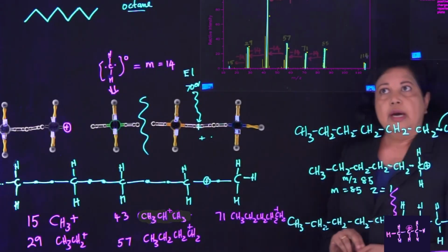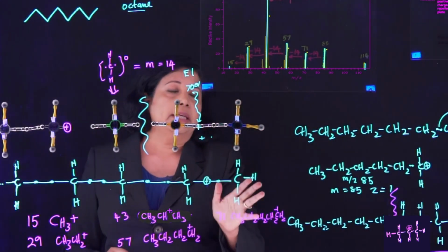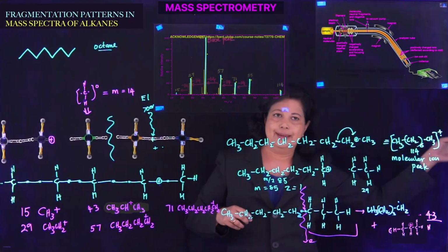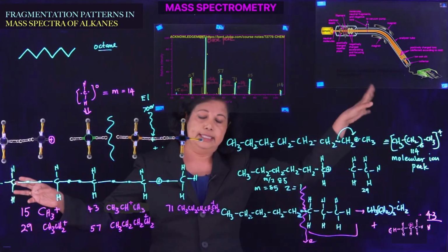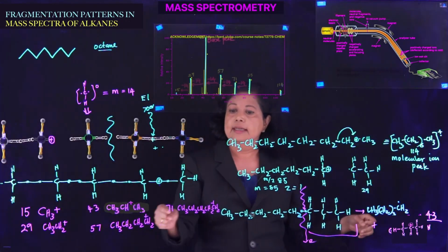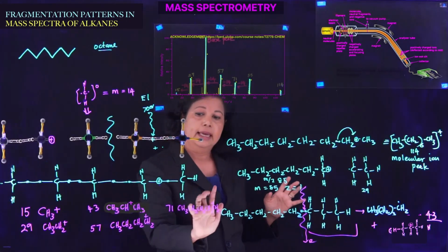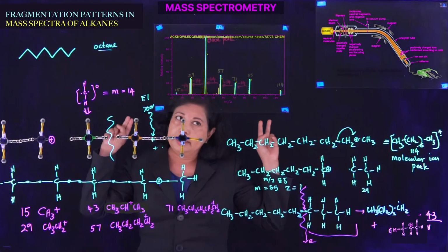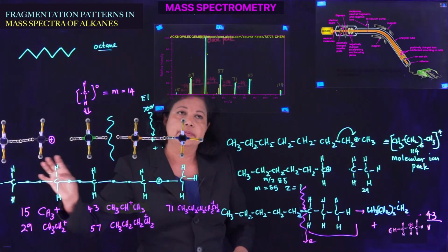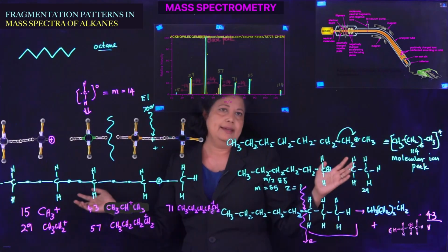So the reason I'm writing these peaks down individually is because a lot of the organic molecules have long side chains, or they have, let's say, a carboxylic acid and a long alkyl tail, and you would see these peaks again. So if you see these peaks at these numbers, it's a good idea to remember that this could be just the unraveling of the alkyl tail or alkyl side group or the alkyl main chain.